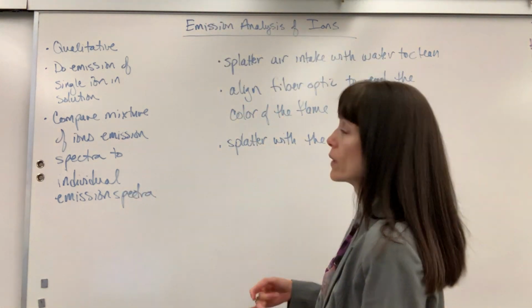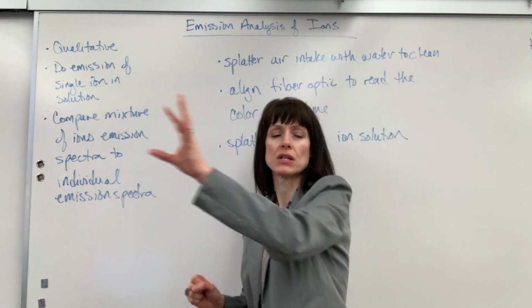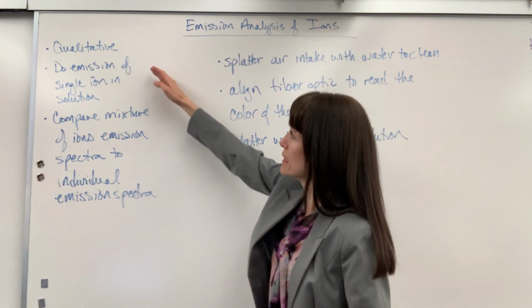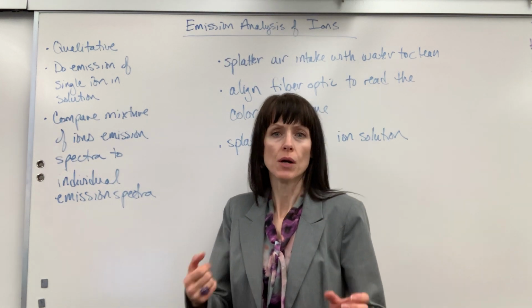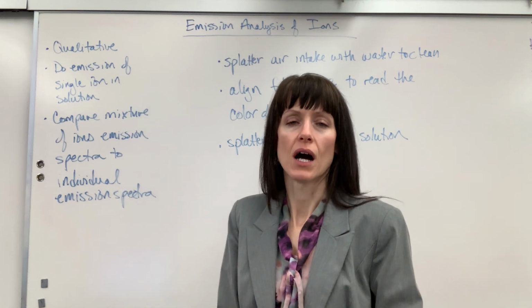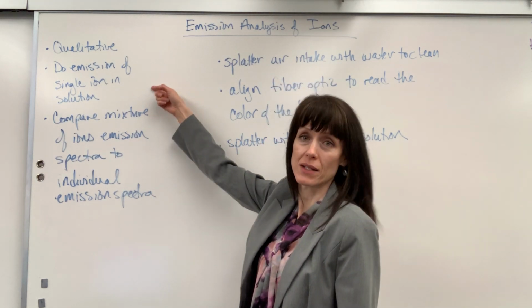Now, what you do is you take those individual solutions, so just sodium, just potassium, just magnesium, and get their emission spectra. So you have the single emission spectra, and then you're going to be given some unknown mixture, and your professor is going to ask you, what are the ions in this solution? So all you have to do is take that emission spectra, you're going to get all these lines, and you go back and compare it to yours.